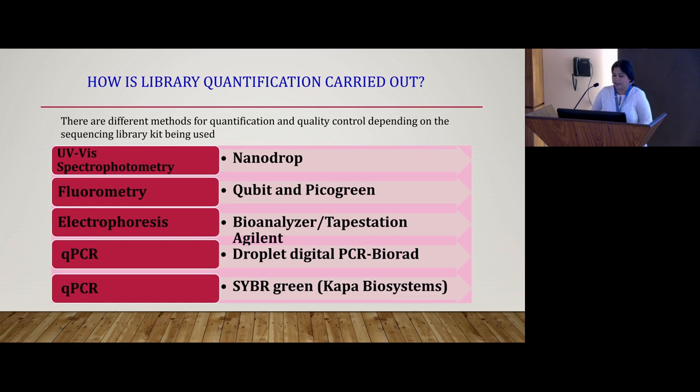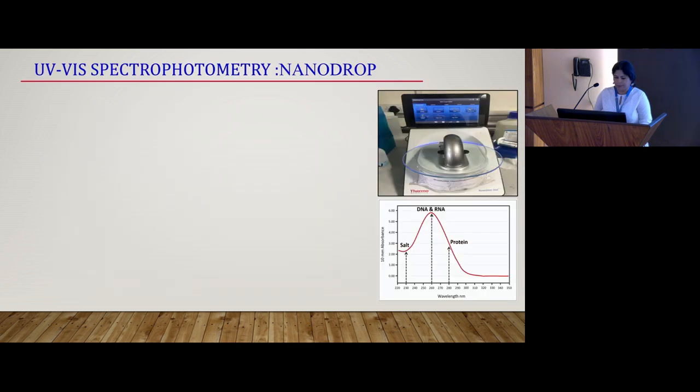Some of these, such as ultraviolet spectrophotometry, require no modification of the samples, while others, such as fluorometry, require staining or dyeing of the sample with molecular markers to enable more detailed inspection. The best choice for a given application depends on many factors, including the degree of accuracy, capital expenditure on your equipment, and cost of consumables, and each of these has its own advantages and specific cons.